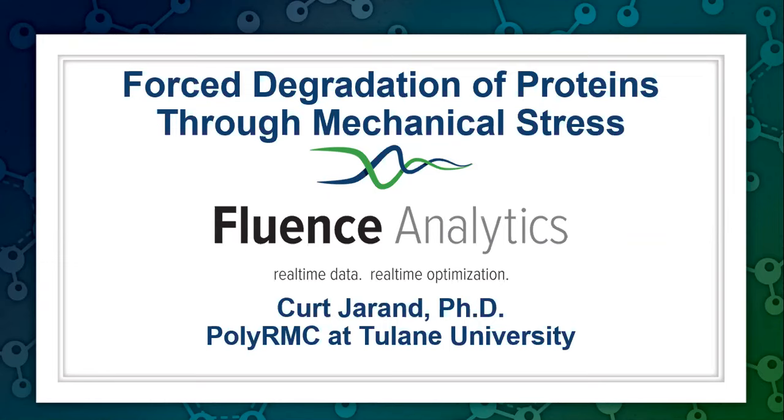So as Matt said, what we're going to be talking about today is the forced degradation of proteins through mechanical stress. The general purpose of this talk is to look at expanding some of the capabilities of routine ARGEN analysis to look at other types of stir and mechanical stress on proteins and how we go about setting up those systems for analysis. In addition to that, I'm going to have a bit of detail on coupling the ARGEN system to secondary detector systems to expand the capability of the system.